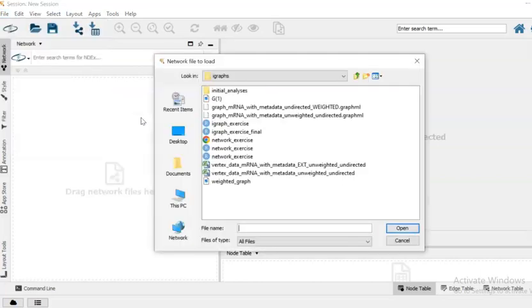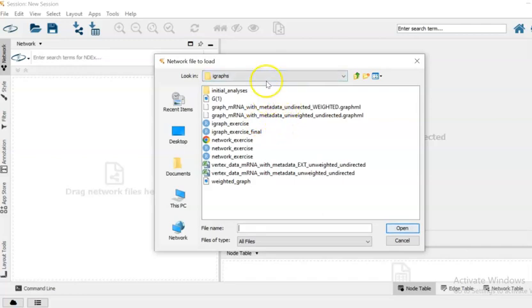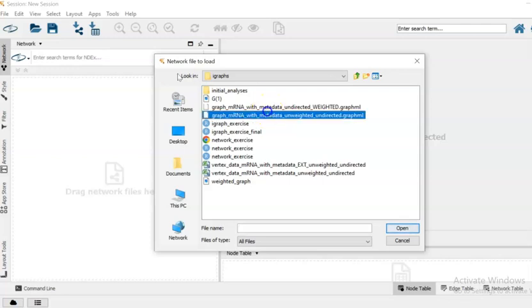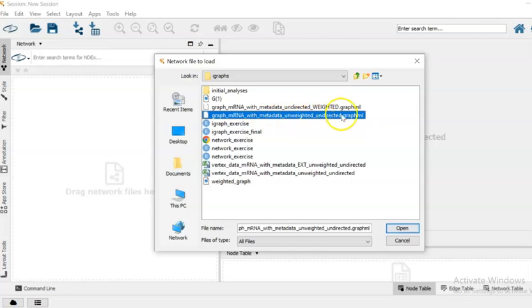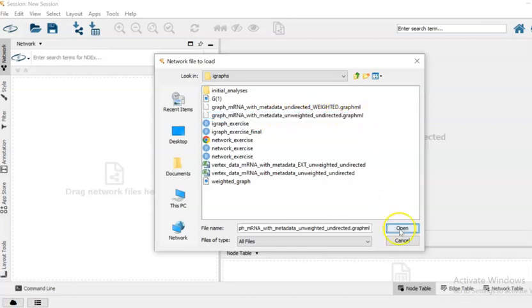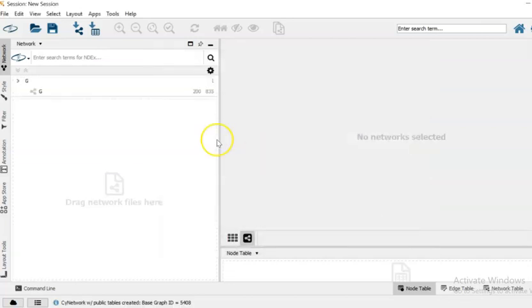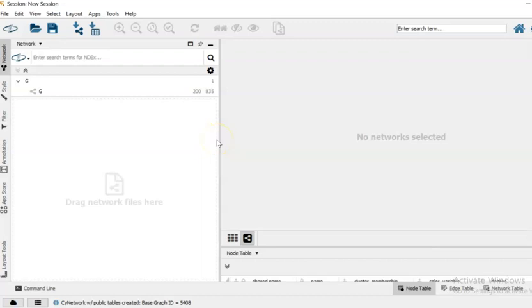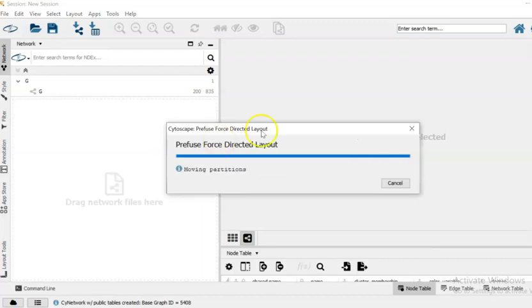That should open our iGraphs folder or you should have to navigate to it, and then the file that we're going to open is called graph mrna with metadata unweighted undirected graph ml. We open it.